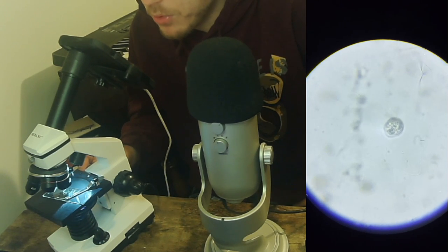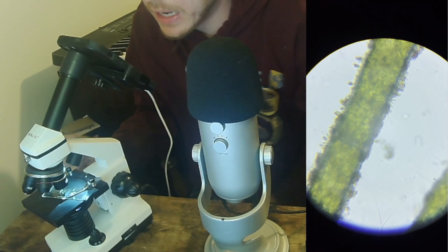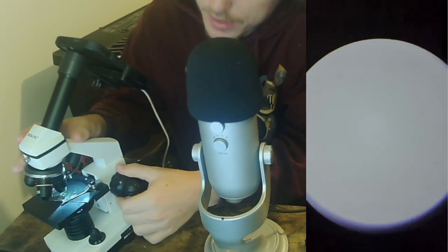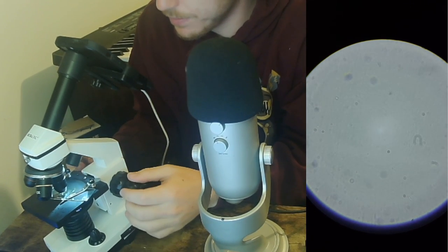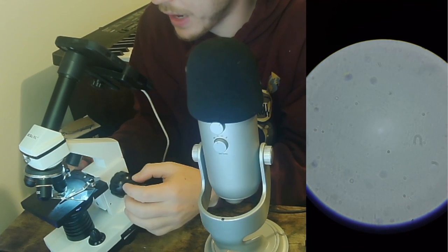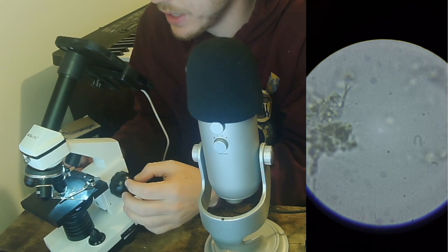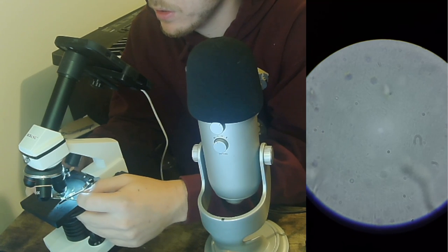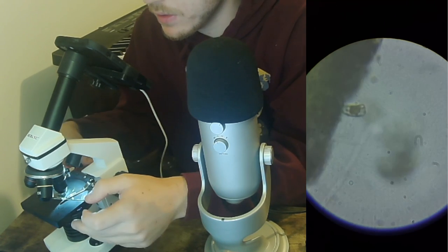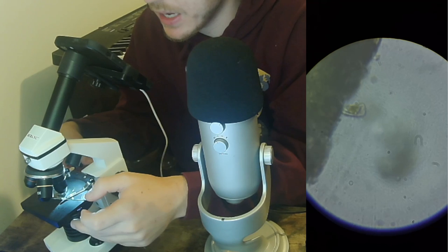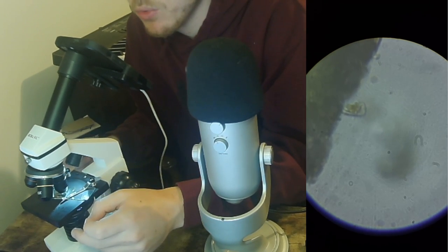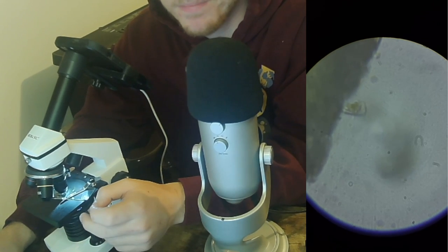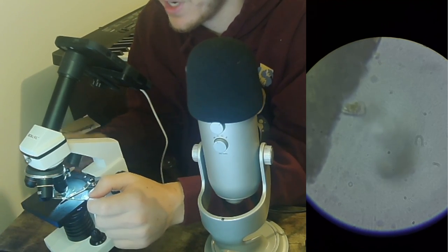So this is I'm pretty sure the family vorticella. This little guy hanging off of the green right here, I'll go ahead and try and zoom in further on them. On the max zoom we're working with 2,000 times zoom now, by the way. We are 2,000 times larger than what you would see in real life.